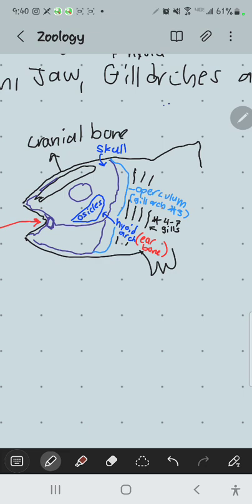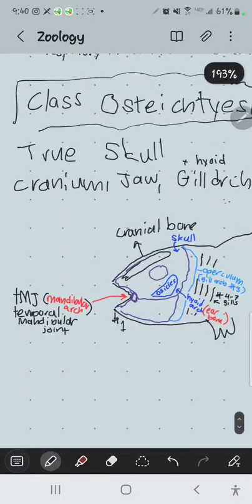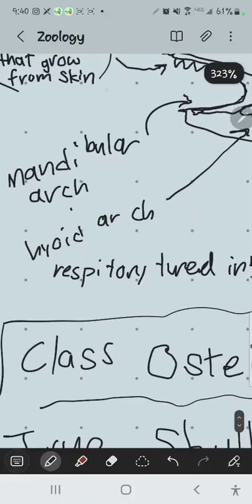And so basically what that means is, I think we're still following this homology. There's a total of 7 different structures. This is number 1. This is number 2. Number 3 is the operculum. And number 4 through 7 are now the respiratory ones. This is number 1, number 2, number 3, 4, 5, 6, 7. You essentially are seeing that the front arches are being modified for other things, right?